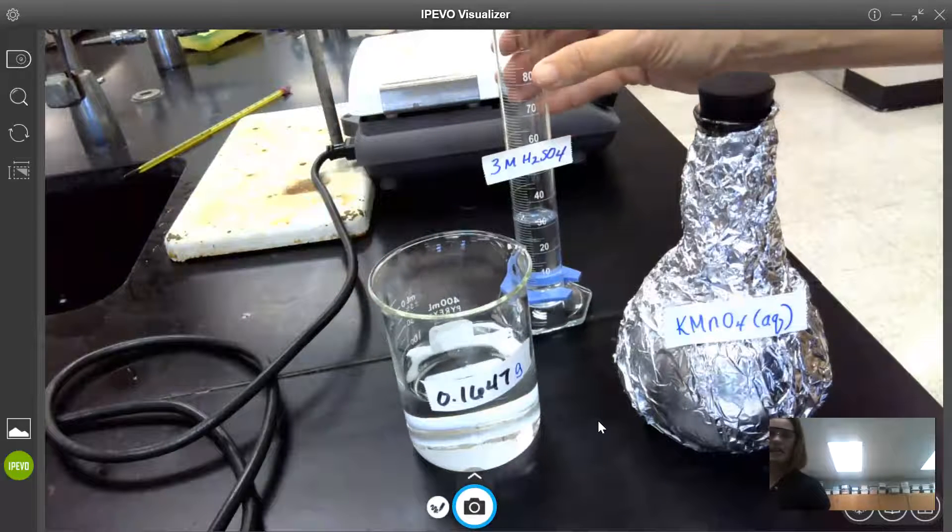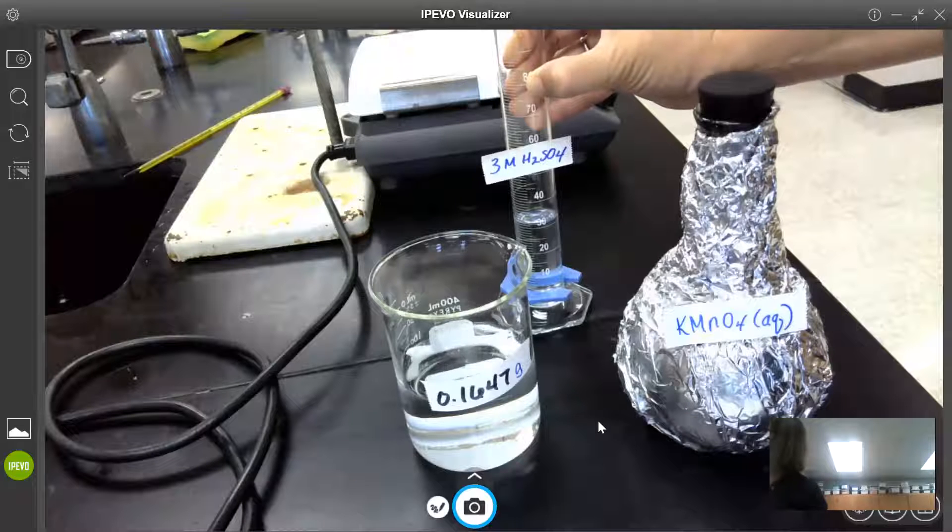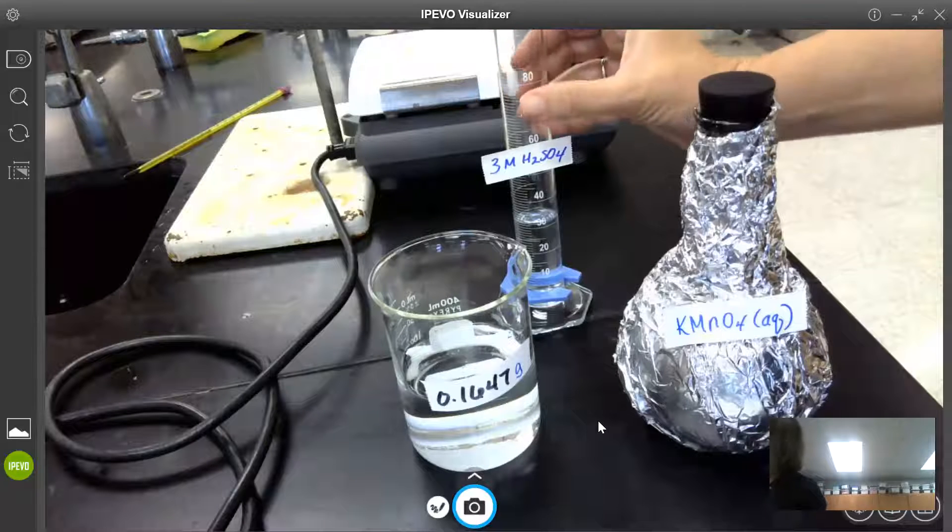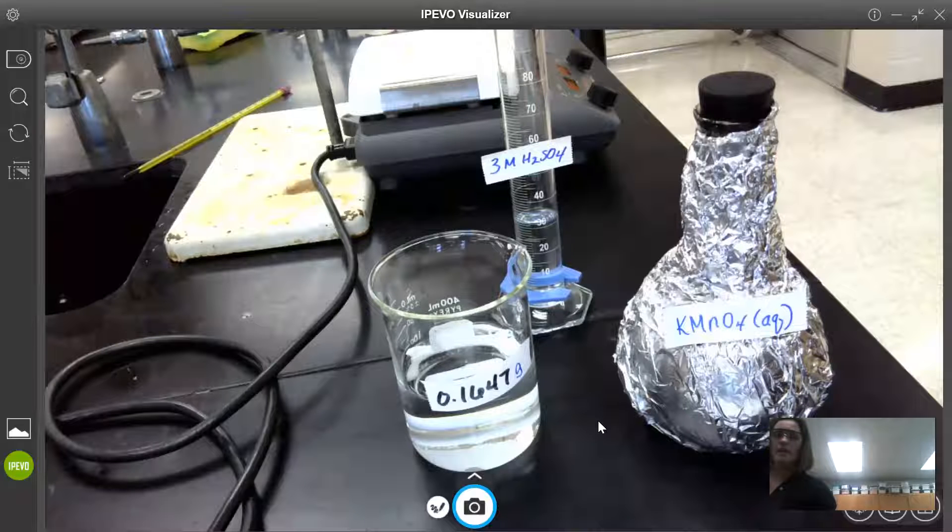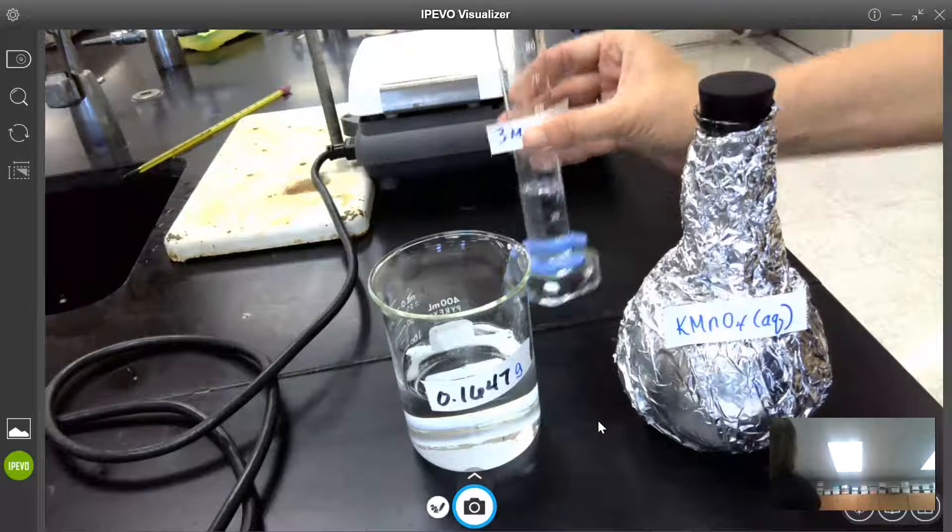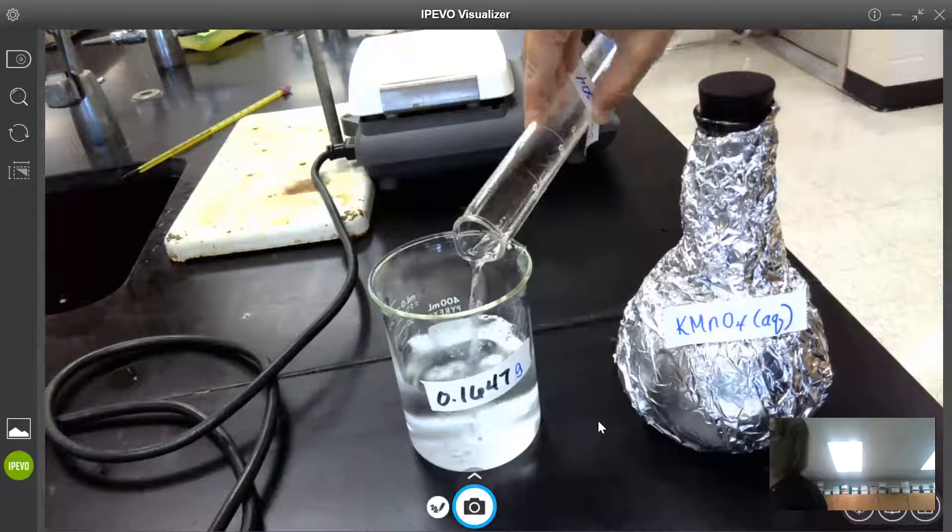I also need to add to this 30 milliliters of 3 molar sulfuric acid. The 3 molar sulfuric acid is added because recall that this titration that we're doing is a redox titration in acid. So this is our source of the acid.